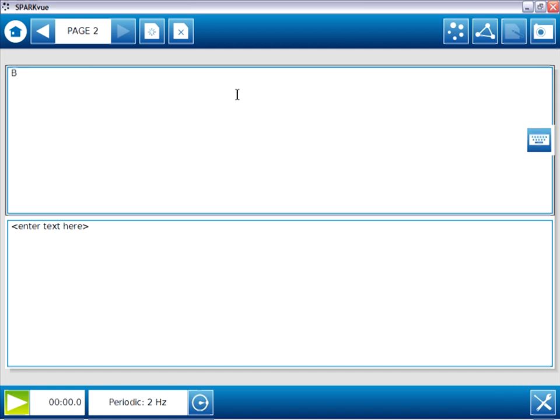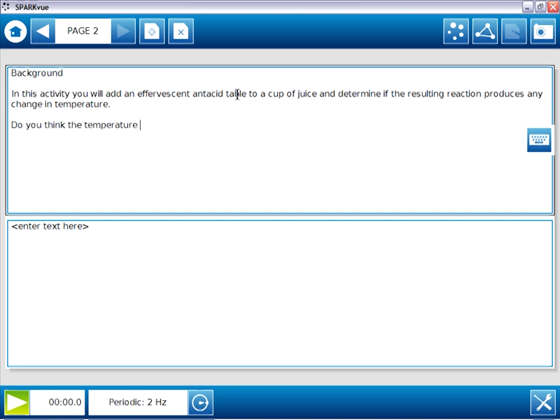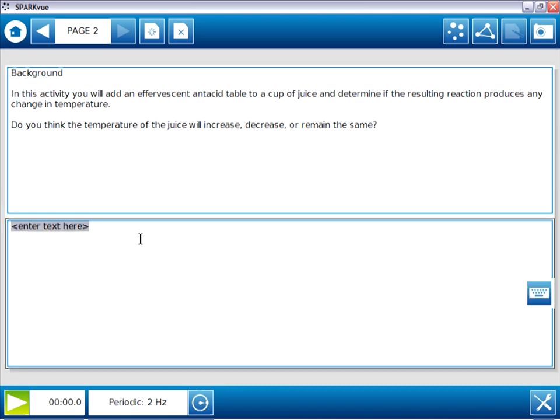And this is going to be a page of background information on the top. And after that background information, I'll ask a question for students to make a prediction. The top box is complete. The bottom box is intended for students to make their prediction. I'll save them a little bit of typing by adding some leading text. And they can simply complete that sentence with their prediction. Page two is complete.